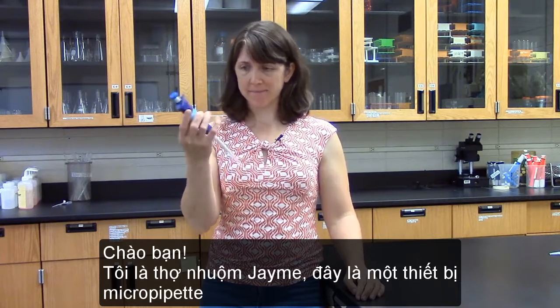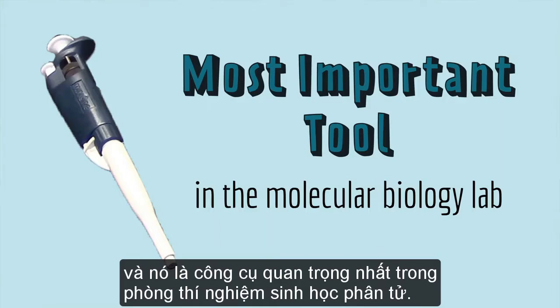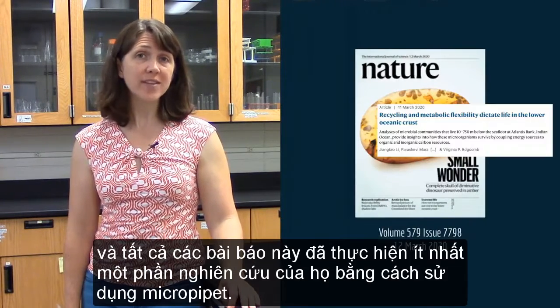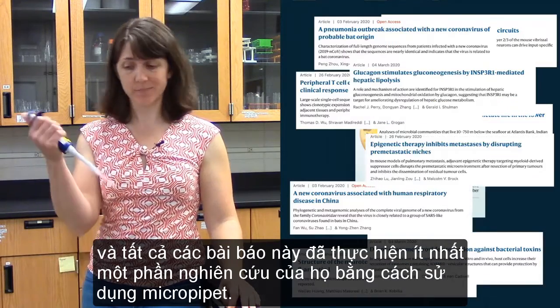This is a micropipette. It's the most important tool in the molecular biology lab. I randomly picked this issue of the scientific journal Nature, and all of these articles did at least some part of their research using micropipettes.